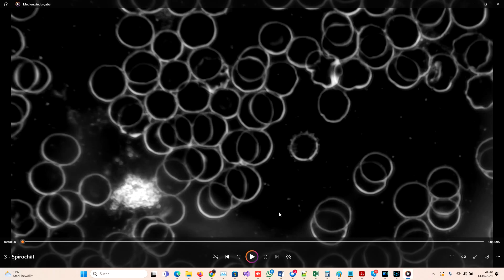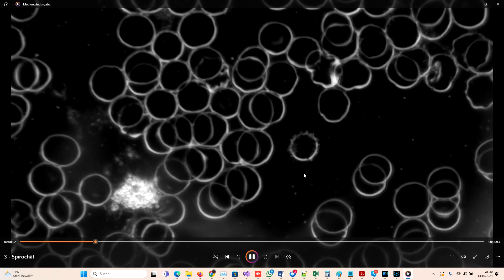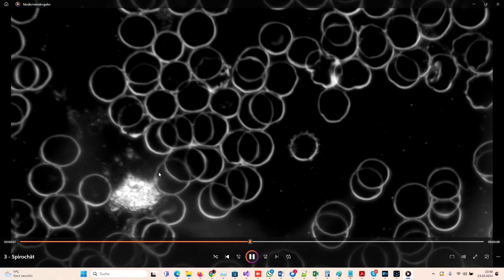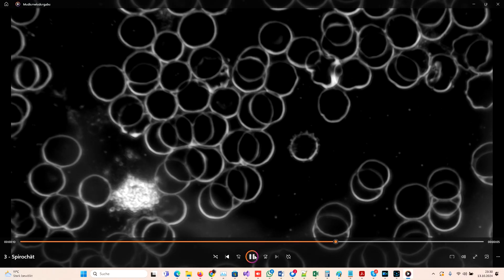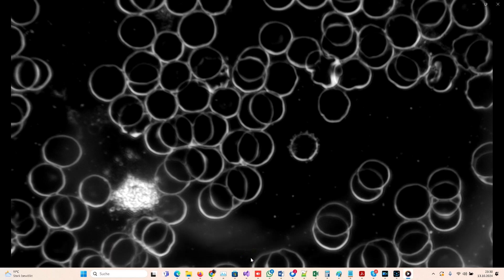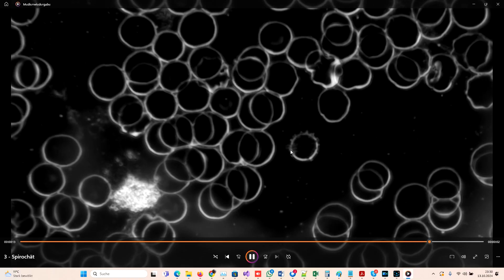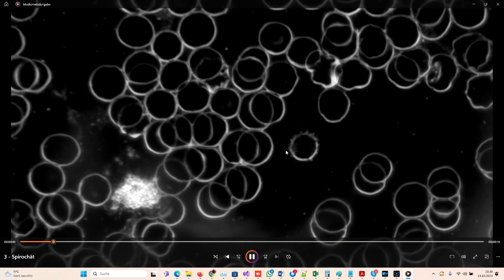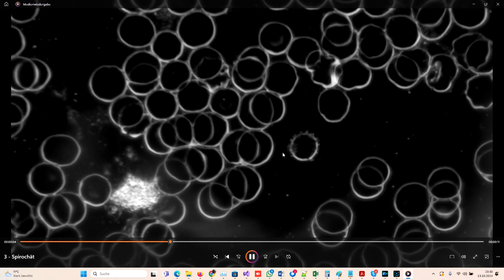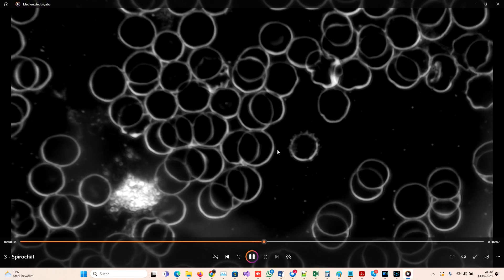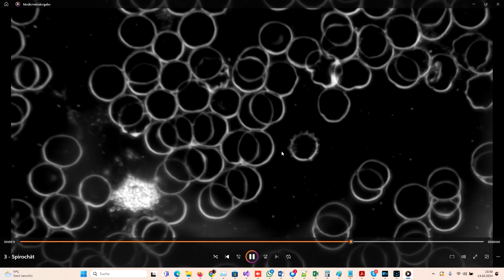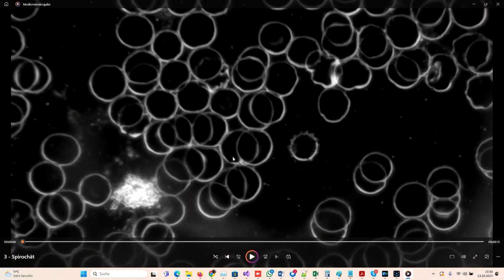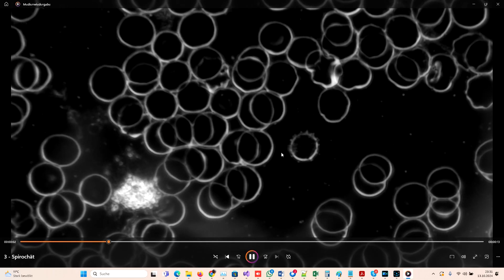Okay, let's start this video. What we are seeing here first of all is a white blood cell, still kind of living but I think dying soon. The really interesting thing, have a look here, especially when the video is running, we see a tiny, very agitated, very vividly moving kind of worm. These things here are the spirochetes. You can identify a spirochete according to the movement that it has - if it moves very vividly, very agitated, very energetically, it's a spirochete.